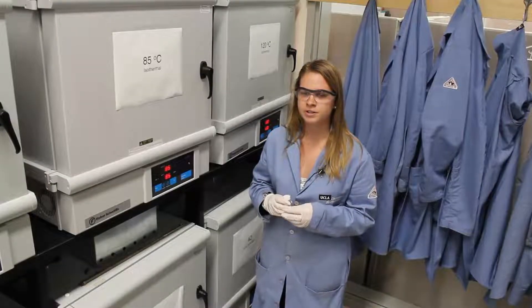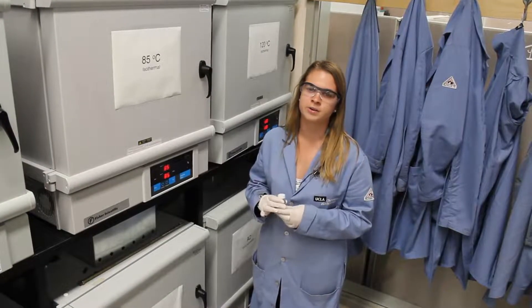We'll put it in a 60 to 120 degree oven from anywhere to several hours to several days.